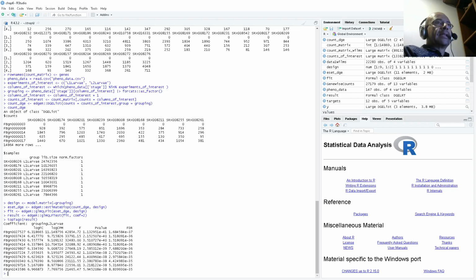Let's start the second laboratory session, where we will be diving into the mouse datasets. We will focus on examining the differential expression in basal and luminal cells found in the mammary gland of mice. These cells play crucial roles in development, homeostasis, and even disease like breast cancer. Understanding the function of these cells is essential for devising strategies to combat breast cancer initiation and progression.